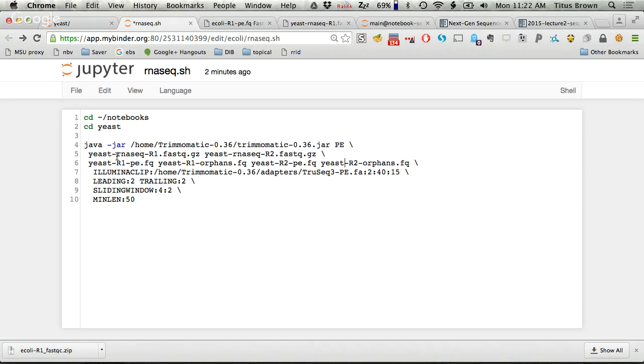Another thing that I kind of want to point out, you're going to be tempted to take shortcuts with file names because it's annoying to type out these long file names. I'm here to tell you to not take shortcuts with your file names because at the moment we can kind of predict what each one of these files is. It's even better if you did, you know, yeast trim, yeast trim, yeast trim. There's techniques like tab completion that will help you match these file names.